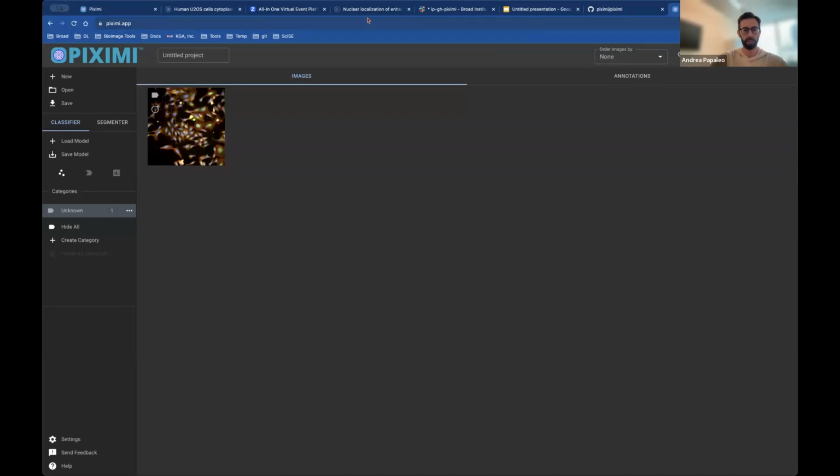Let's see, two in the chat. So yeah, what's the limit of the computer power of the uploaded image? I'm not quite sure what you mean by that. The limit of the computing power is essentially what your computer can handle, because it does run locally.